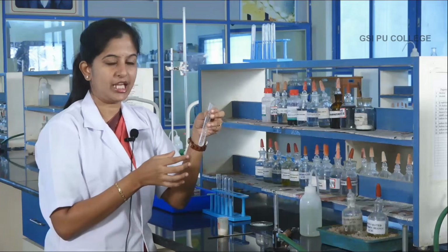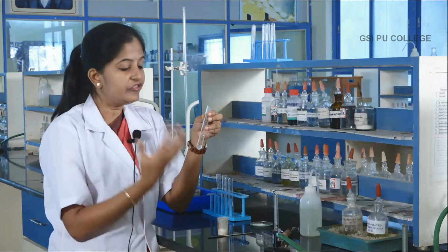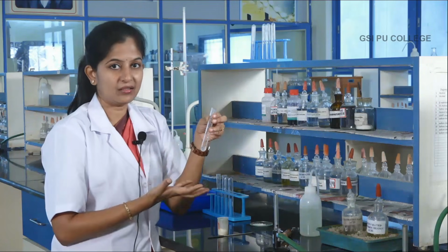What happens when the paper ball is added? After heating and adding the paper ball, if you get brown fumes, it means the second group acid radical nitrate is present. If brown fumes come, it is nitrate. If the solution turns black, then the second group acid radical is absent, and you have to go for the third group, that is sulfate.